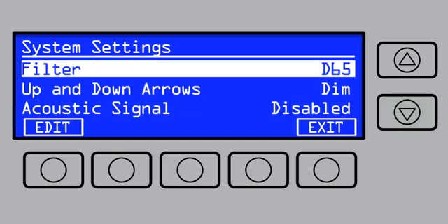Depending on your model, the factory default for the filter is either D50 or D65. Only change this setting if the filter is changed by an authorized service technician.